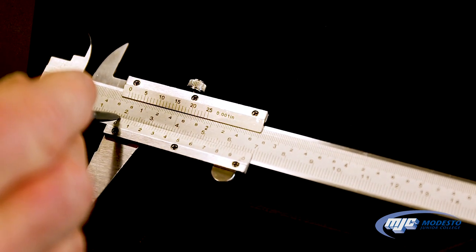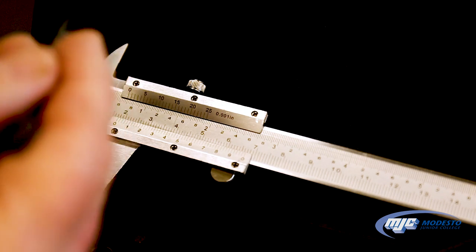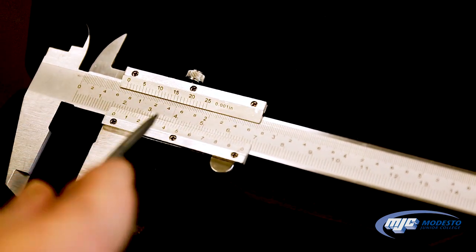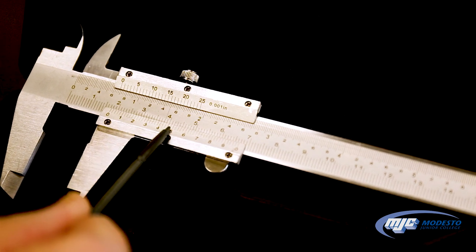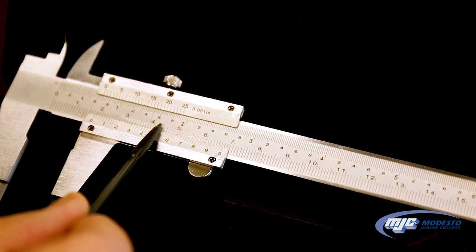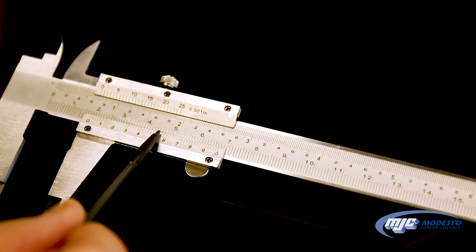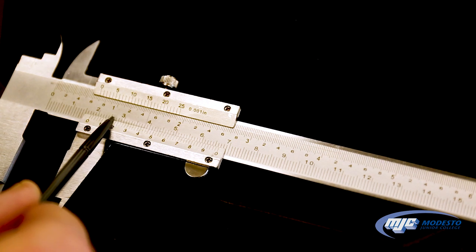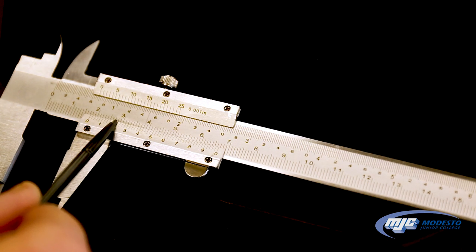The next thing we do is, remember, it's 1.7 something something. To get the last two digits, what we do is we go down to this scale here and all we're looking for is the one line here that best lines up with some line right above it. So for instance, if we see the two here, it doesn't really line up very well with any of these lines above it.